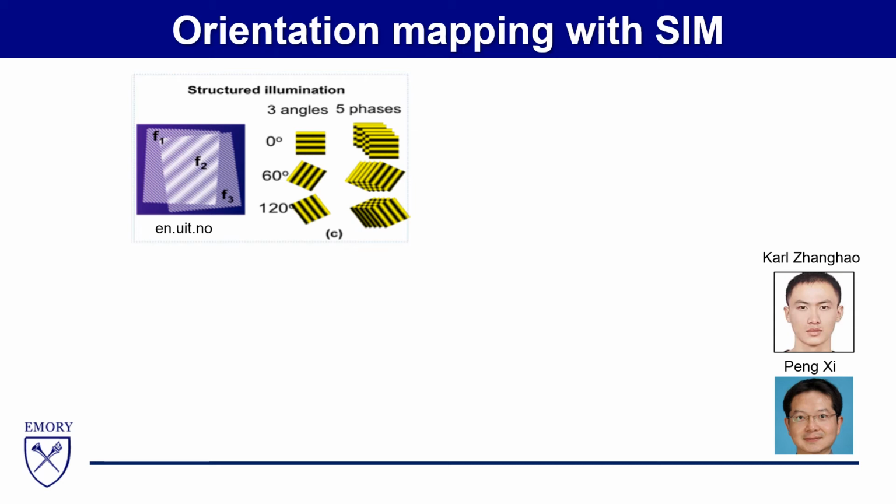And by happenstance, we found a recent paper in Nature Communications from the lab of Peng Xi at Peking University in China that showed that you could use a structured illumination microscope to perform the same type of fluorophore orientation mapping that molecular force microscopy requires.